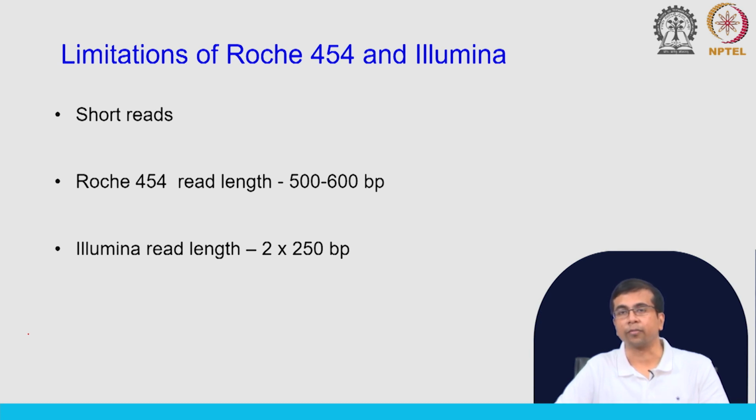On top of that, we will have structural variations. We will talk about what structural variations are in the next classes, when we talk about variant calling, and you will understand that. Especially for resolving the structural variants, these short reads are not really suitable, and we would like to have really long reads. So, longer reads will be much better. If you compare Sanger sequencing, we have 1 kb, but can we get at least 1 kb, and if we can, more than that.